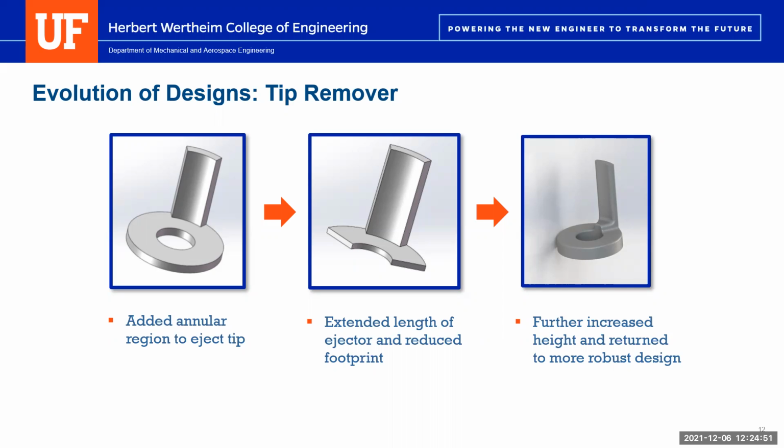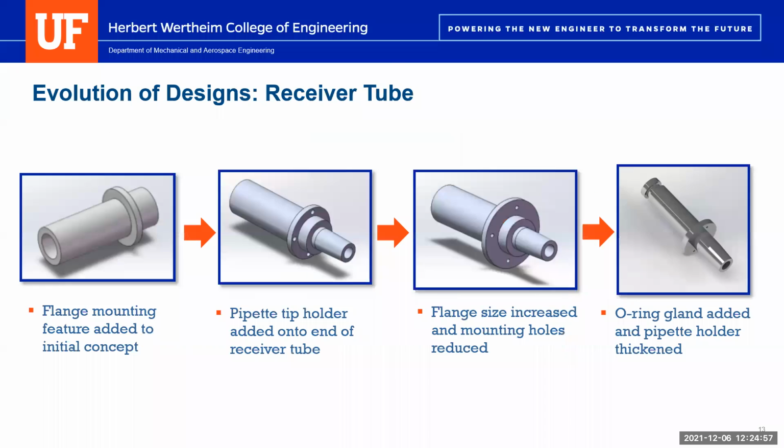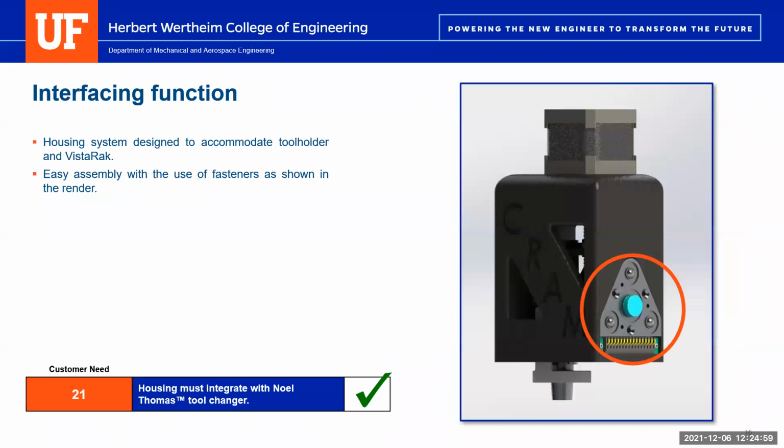Yes, this is Tom Singer from Northrop Grumman. You were showing your tool adapter, the triangular shaped deal, and that's got some electrical connections on it. I'm curious, where do those connect? Do those go through your pipetter, or where are the cables running, and where do they come out?